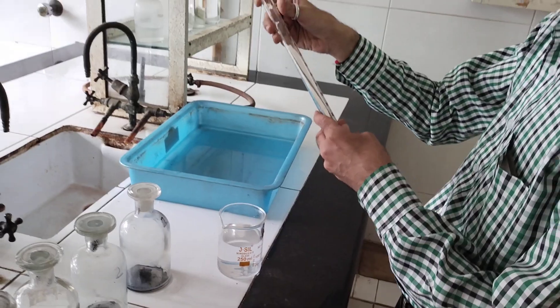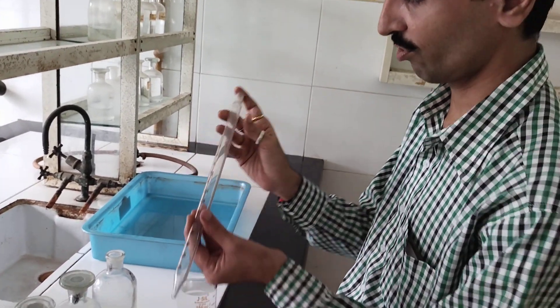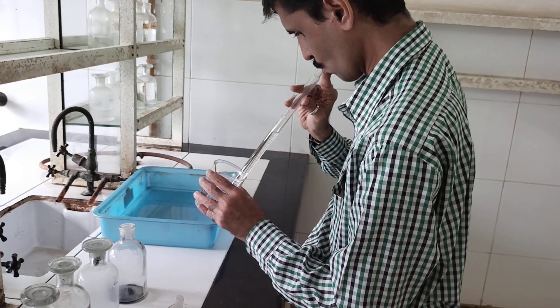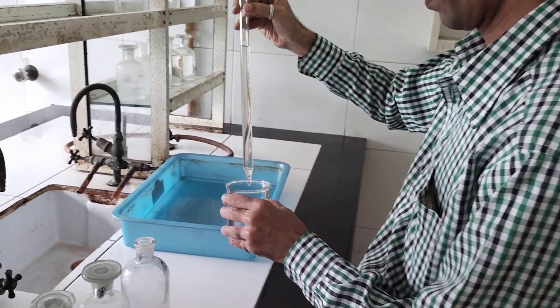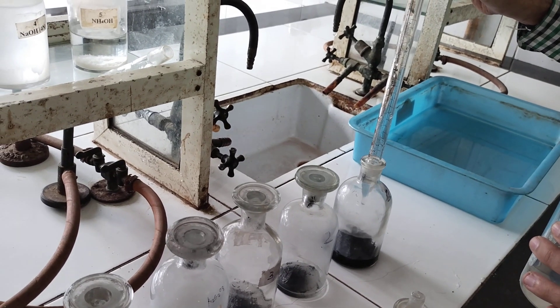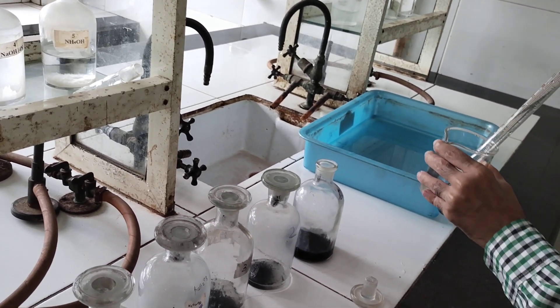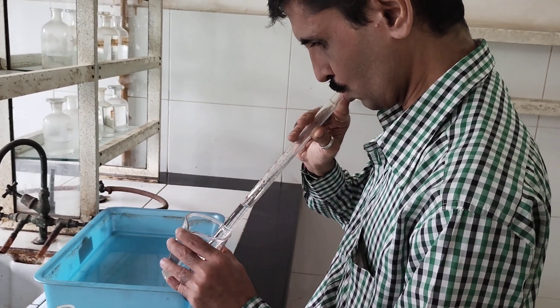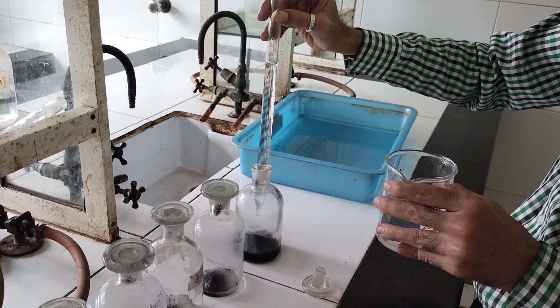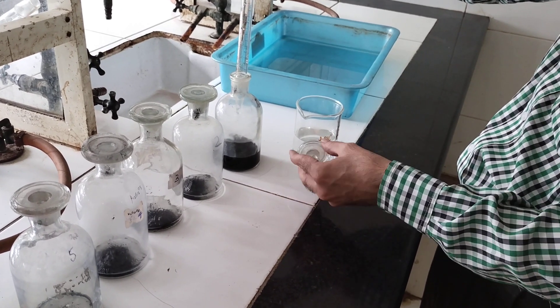We start with the first one and that's going to be 25 ml — this is a 25 ml pipette and I need to add 50 ml, so I will be pipetting out twice. This is the first increment. So this is 50 ml — now the second increment. So this is 50 ml.